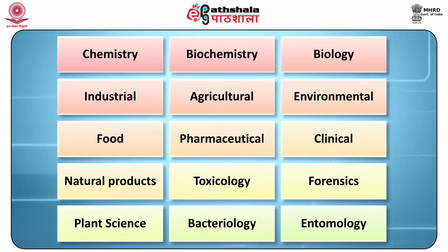TLC has been applied virtually in all areas of analysis, including chemistry, biochemistry, biology, industrial, agricultural, environmental, food, pharmaceutical, clinical, natural products, toxicology, forensic, plant science, bacteriology and entomology.